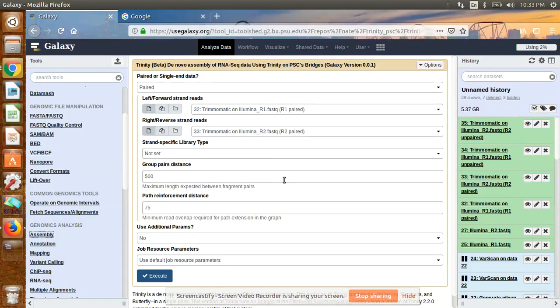Today I am going to discuss how to assemble raw reads into contigs. If you have a reference, you can map all the trimmed contigs to the reference. But if you don't have a reference — for example, if you are working on a novel organism — then the reference is not available in NCBI. In that case, you have to go for de novo assembly to get your contigs, after which you can use those contigs as a reference to map your reads.